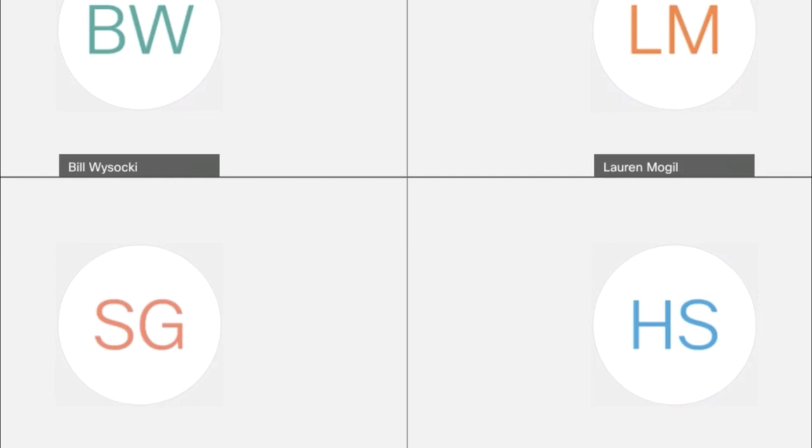Okay, and which tools do you use for cell type annotation? Can anyone do the process automatically? Usually that is provided with the samples that have been analyzed, but there might be ways to do some marker identification.